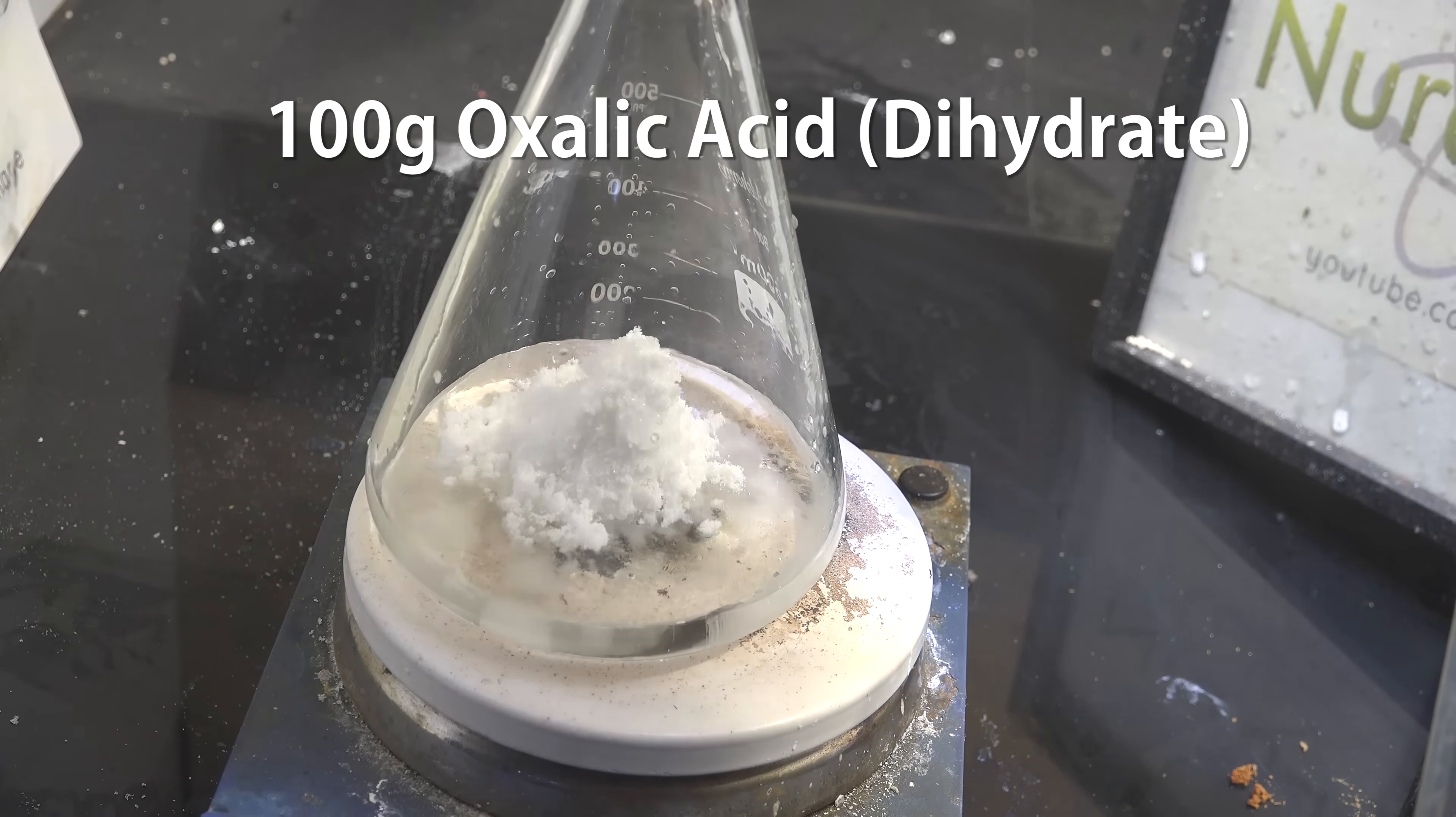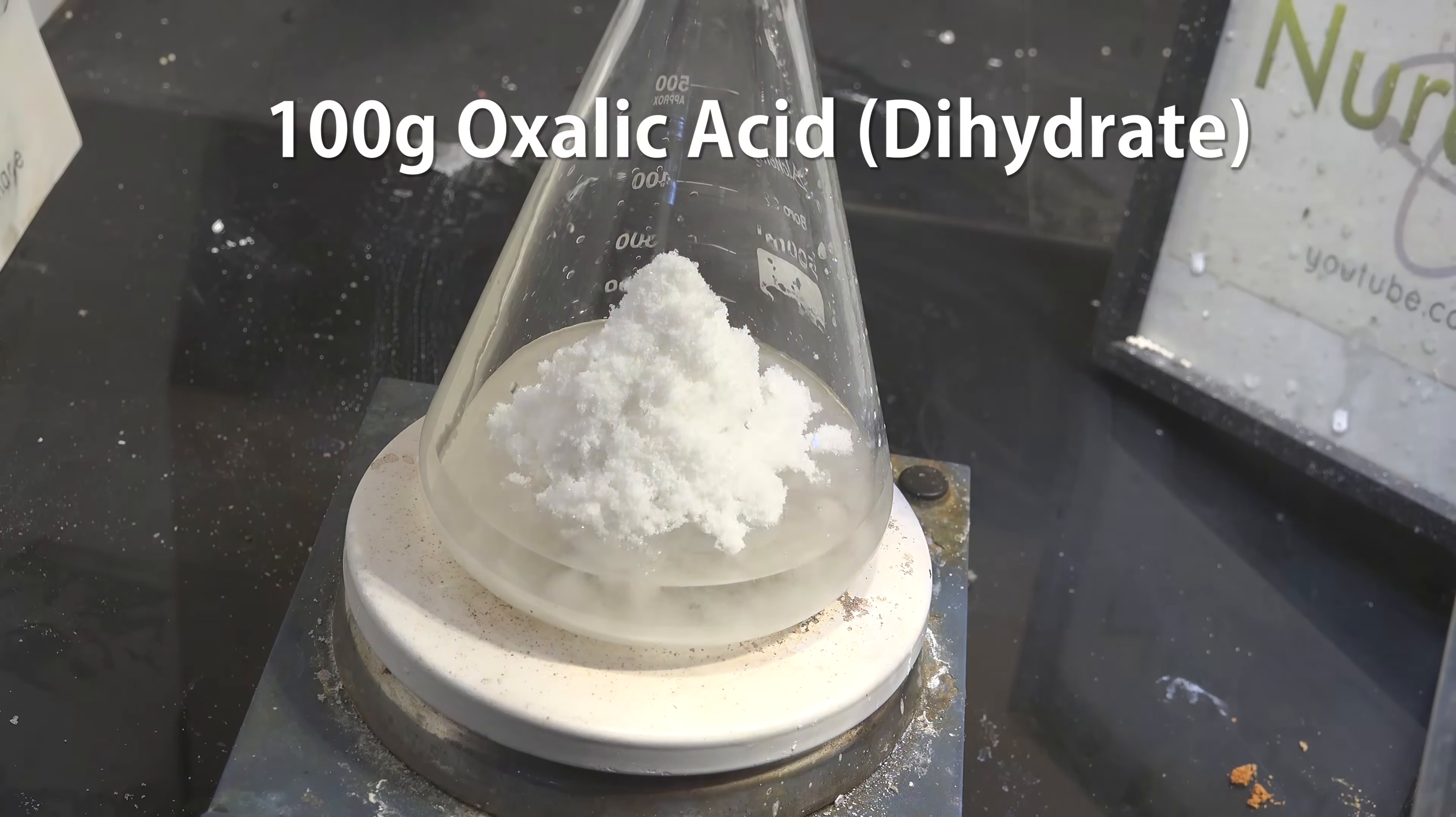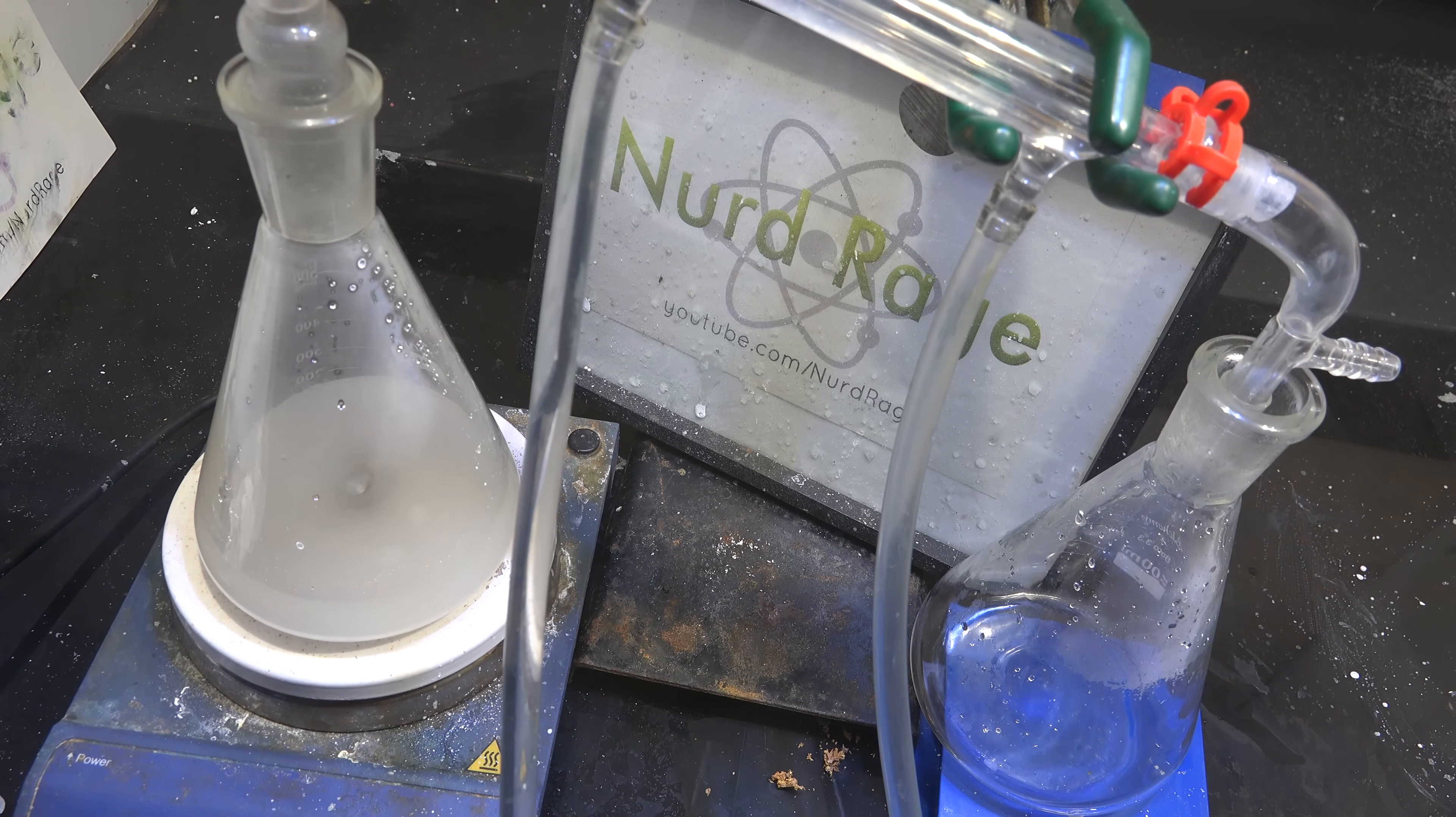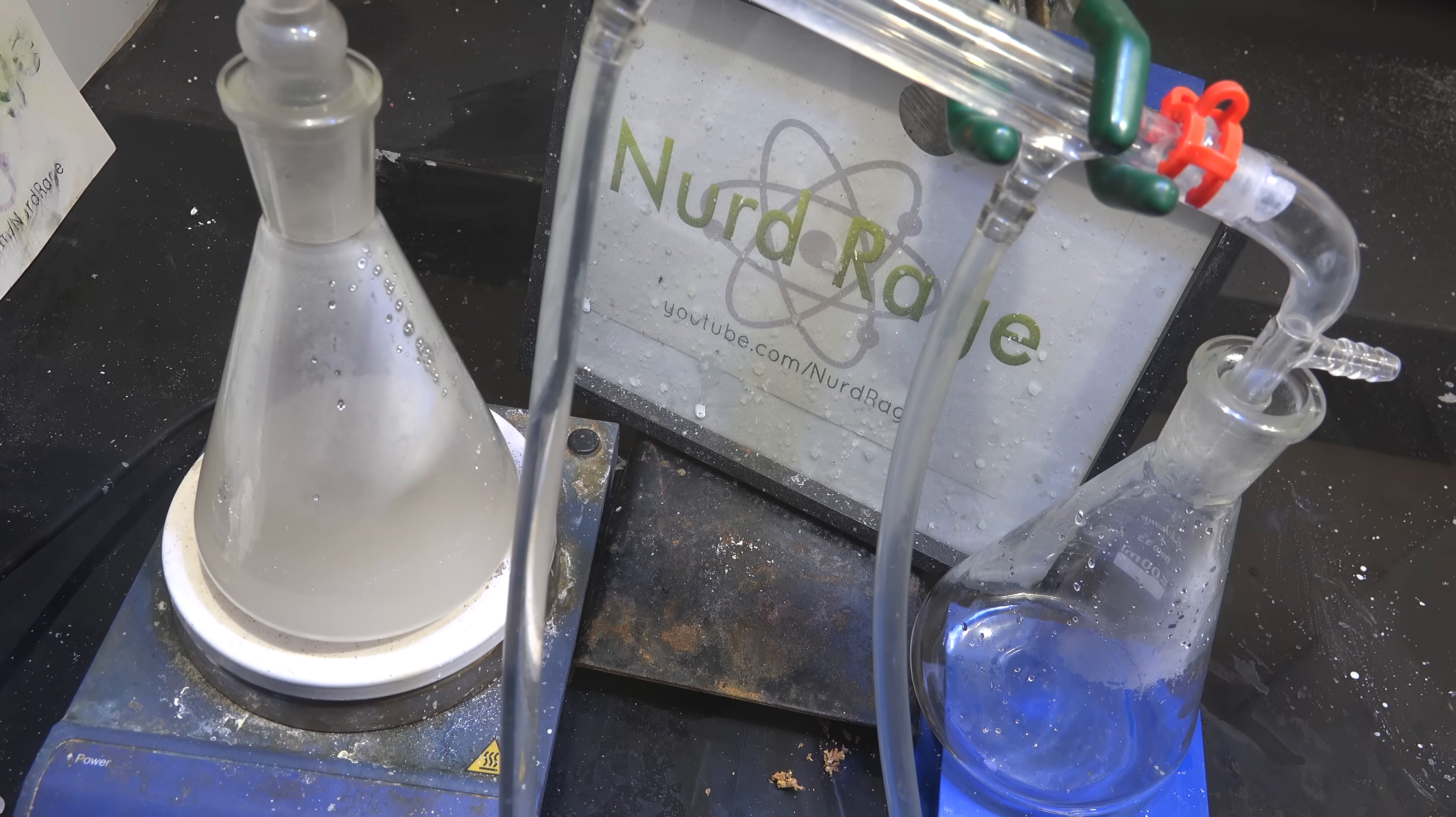Now add 100 g of oxalic acid dihydrate. Set up a distillation apparatus around it and warm up the mixture. Now it's important to keep the temperature of the mixture between 105 and 120 degrees celsius. If it goes too high it will decompose the reactants.